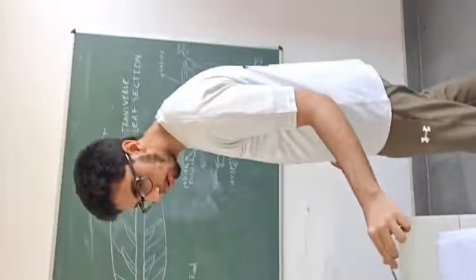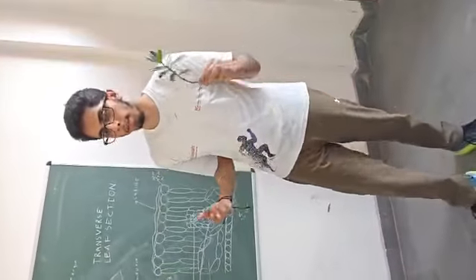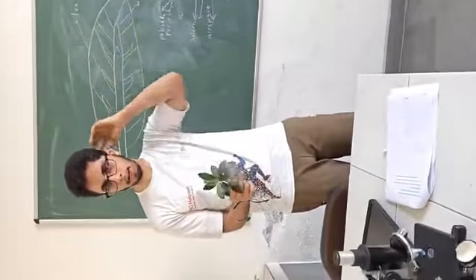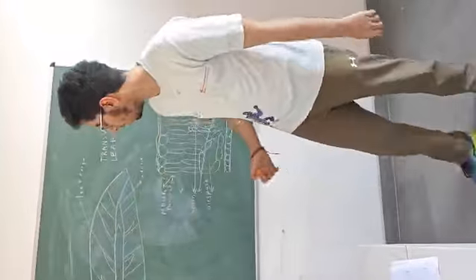So the first thing is we're gonna learn how to look at leaves in a microscope, because it's important to understanding what makes a leaf so special, right? Because they are what gives us oxygen, and they are what takes our carbon dioxide, and without plants, frankly, we wouldn't be alive today. So yeah.